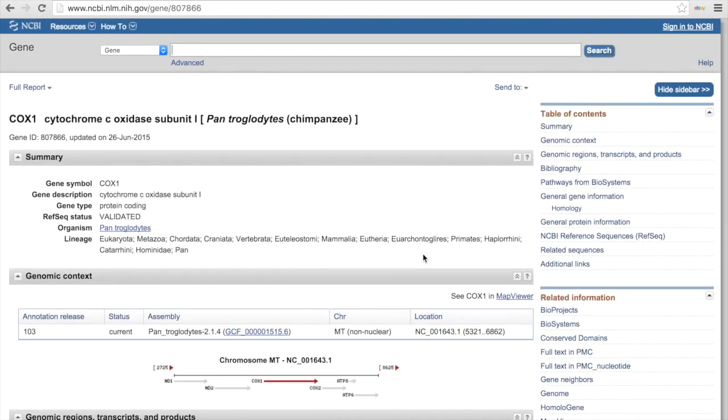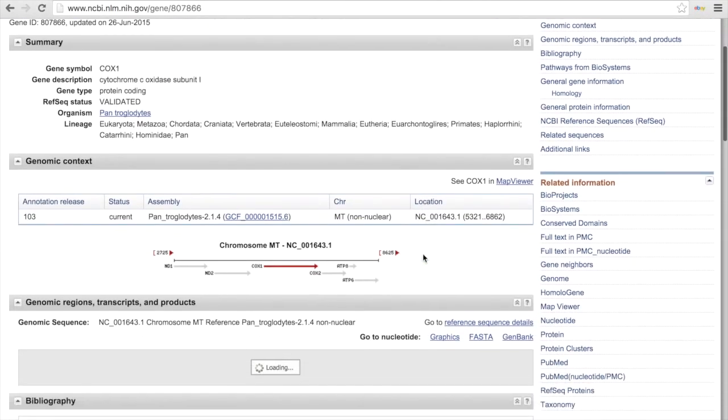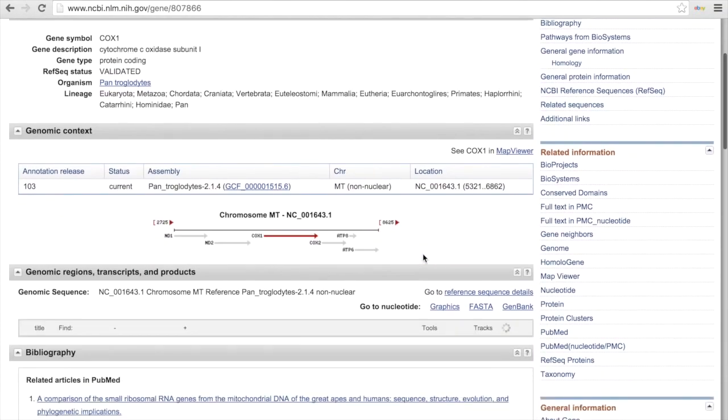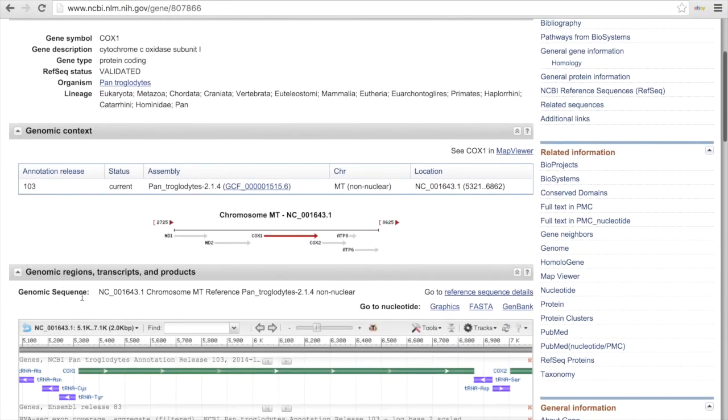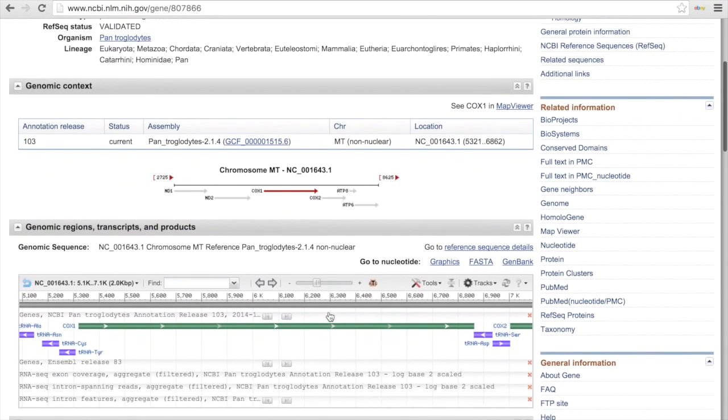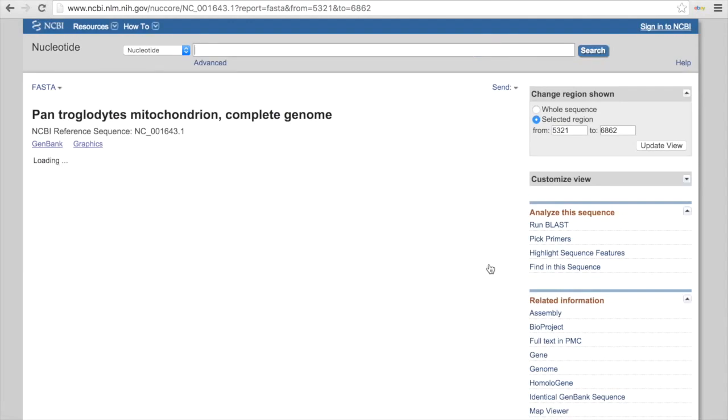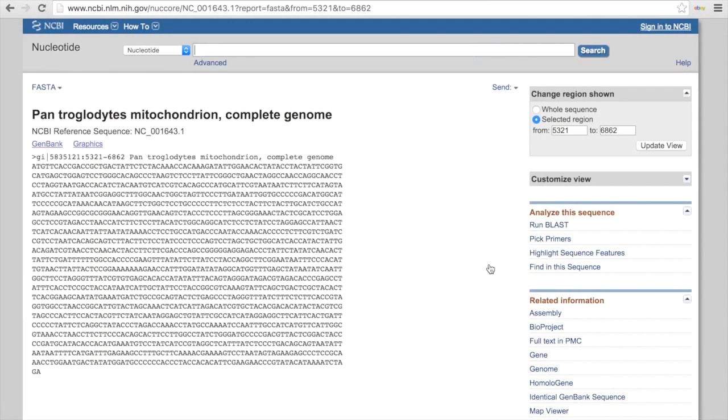This will take us to information about this specific gene. This is information about our gene. What we need for our purposes is under the genomic regions, transcripts and products, there's a link that says go to nucleotide. I'm going to click on the FASTA, and this will give me a readout of the nucleotide sequence for this gene. And here it is.